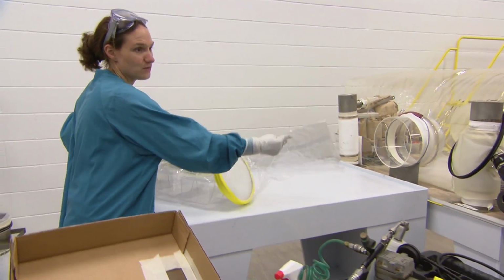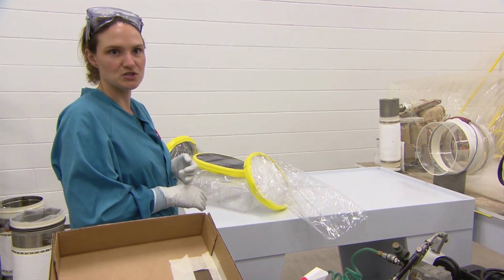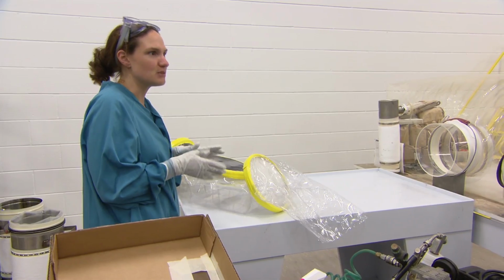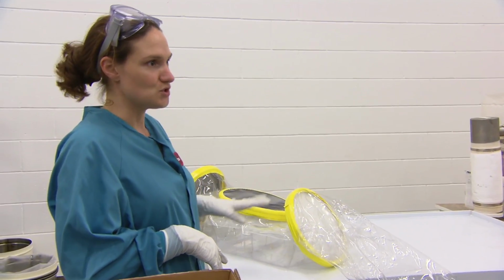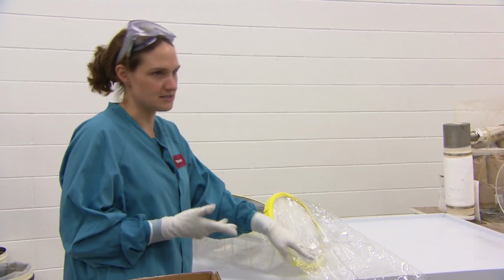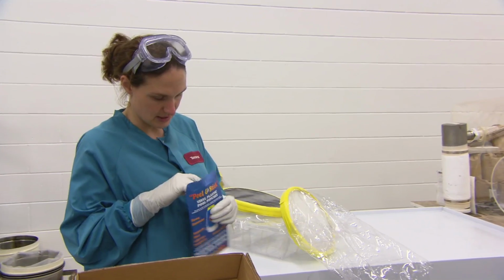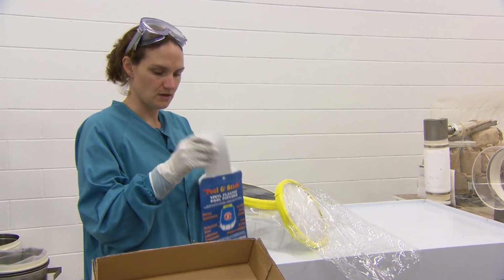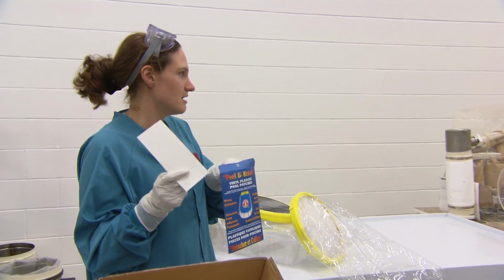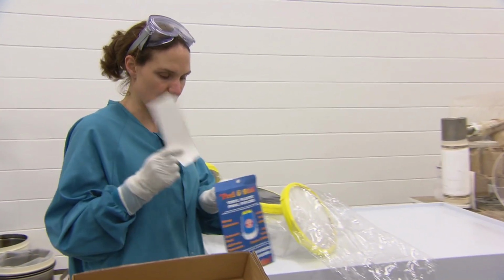Now here, again, we don't want any holes, but if for some reason we do find a hole, or you just find a bend in the plastic or something that doesn't look good, you can always use a pool patch to patch this, because you're going to do the sterilization as we hook up. These are our pool patches that we use. And we use these on shippers, on the isolator itself. These are great. They're water resistant, so they work really well.